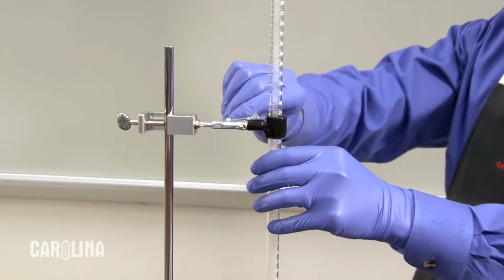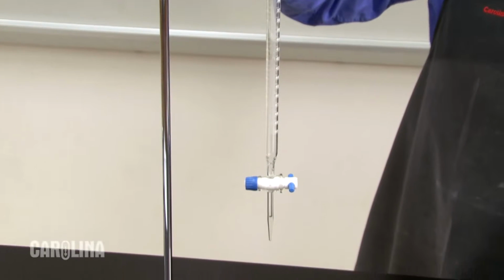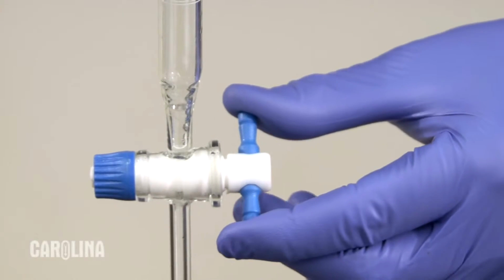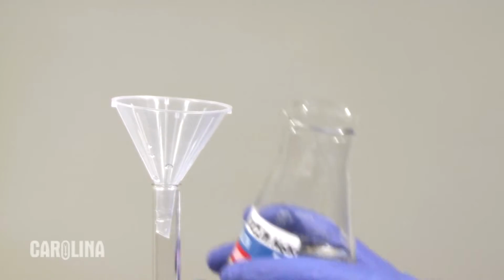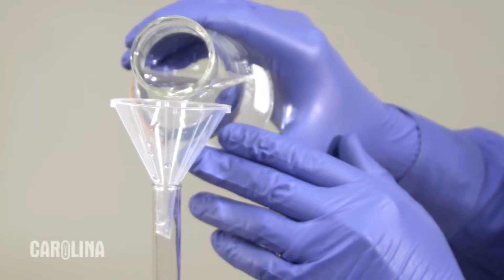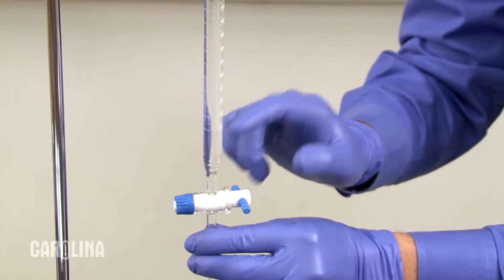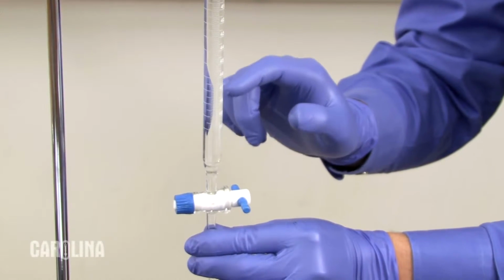Mount the burette in the clamp, making sure it is positioned vertically and there is enough room to position your flask underneath the tip. Check to see that the stopcock is in the closed position. Insert the funnel into the top of the burette and fill with titrant almost to the top. Filling exactly to the zero mark is not necessary, but you do need sufficient titrant to complete the reaction. Check the column for air bubbles and gently tap to free them from the side walls.